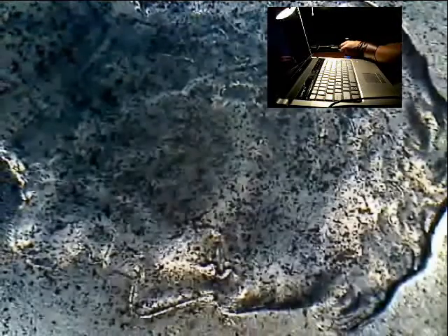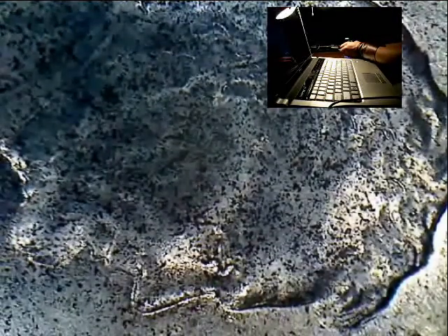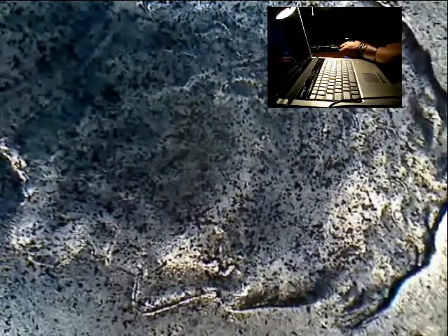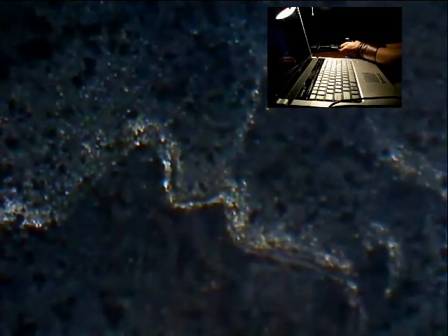Real quick, I've got myself a 1943 steel penny. These guys are fun. I'm going to zoom back down to the low setting, and there is Abraham Lincoln. He's seen better days, but this is a very old coin comparatively. So I'm going to zoom back in, and then you can see kind of the surface of it. And it's not fared well comparatively over the test of time. Steel isn't that robust. And here are his lips and part of his beard. So you can see we can zoom in pretty well on this.